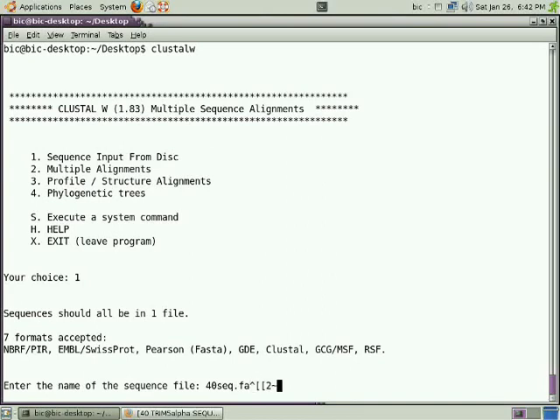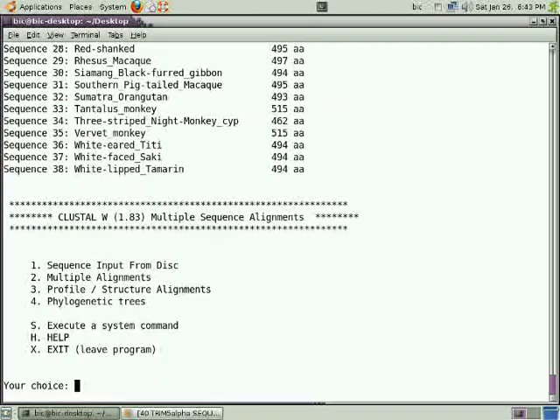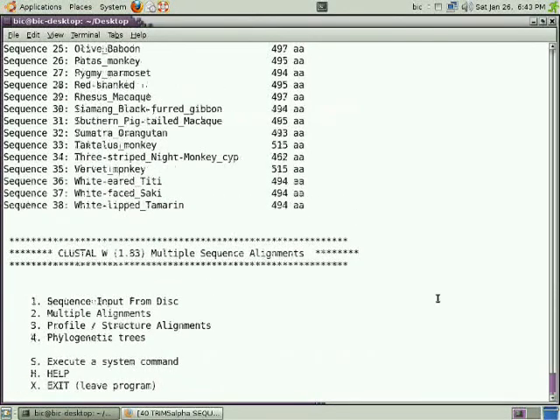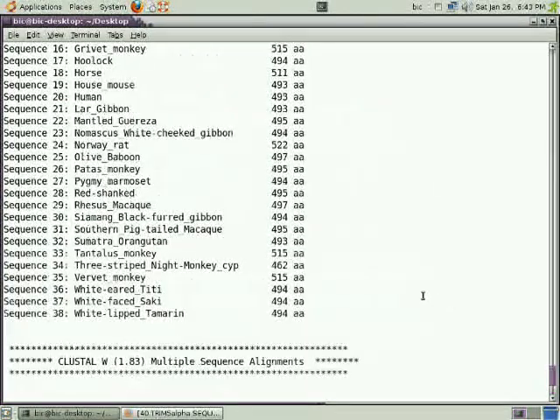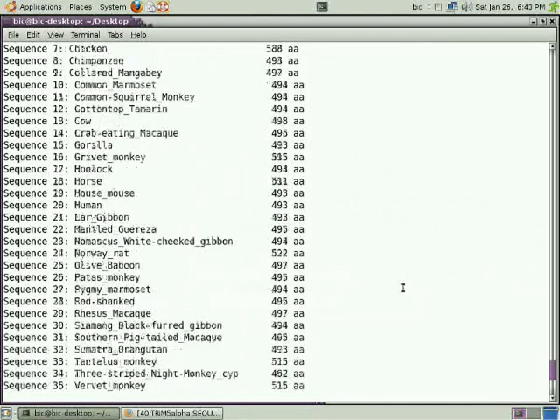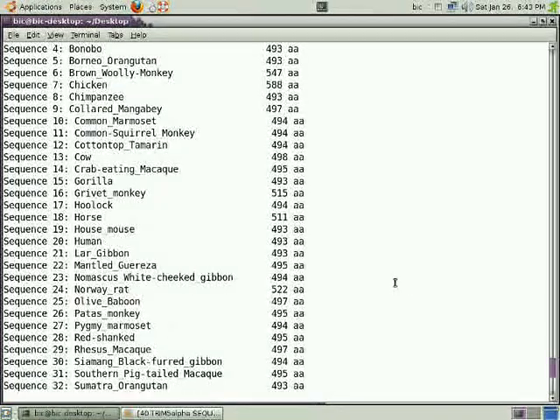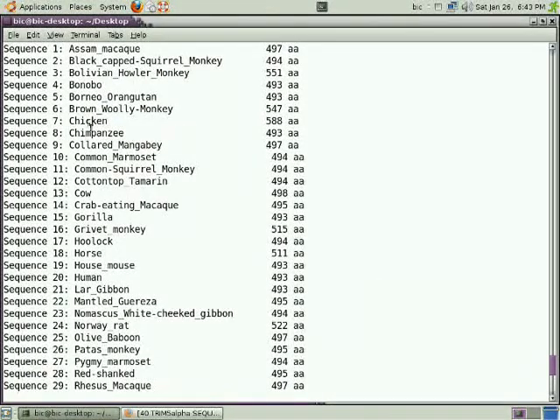I am using the file '40seq.fa'. I have provided primate sequences - primate protein sequences of 40 primates. This includes human, chimp, gorilla, and also some vertebrates related to the primate group to check the homology of the sequences. You can observe 38 sequences which I have provided here.